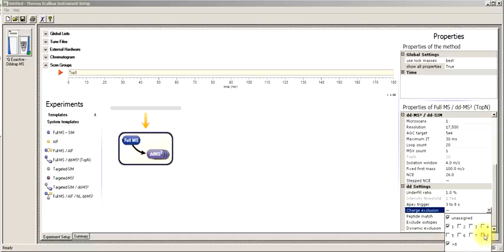What I normally do is ignore anything above 7. This is because the most recent iterations of Mascot simply cannot sequence anything with a +8 or more charge, and so why collect those if you're using Mascot? Other search engines also have deficiencies in this area due to how the algorithms are written, but newer engines may allow us to do a better job of fragmenting these larger ions.